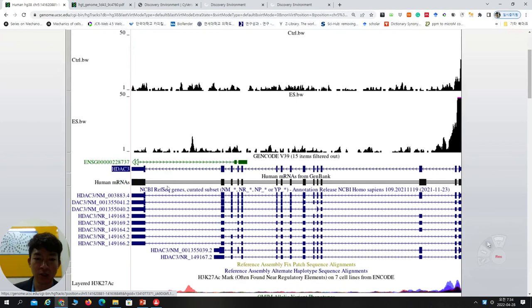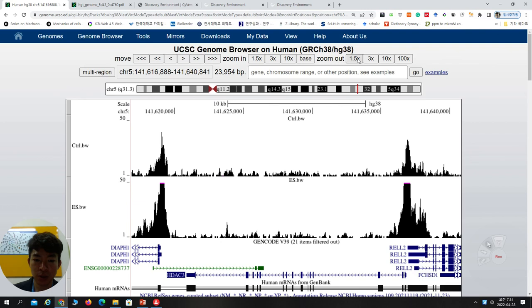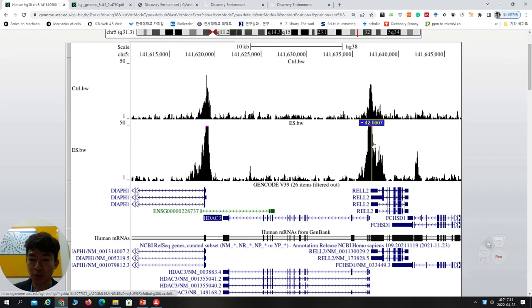When you go to HDAC3, the level is not shown at a glance — you have to zoom out. As you can see, the HDAC3 level shows a similar pattern. There's not much change overall, but here, they are highly expressed in the ES group. This is related to the promoter region of HDAC3. When the HDAC3 promoter is more accessible by ATAC sequencing, it means there is more chance to be expressed and transcribed.